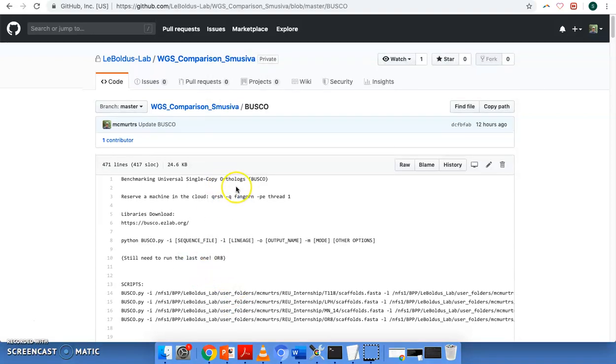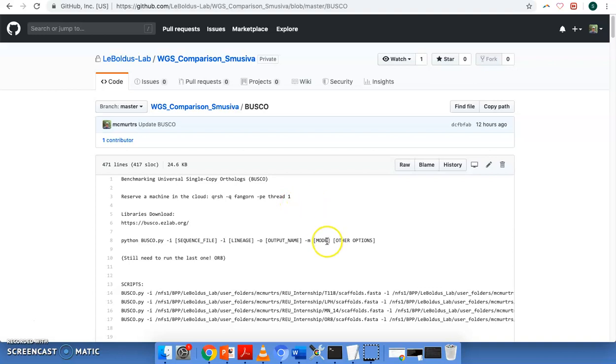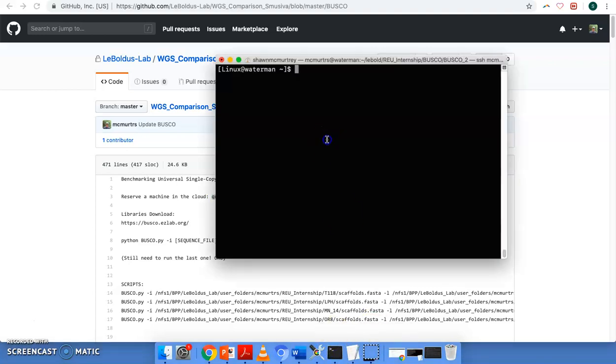I've also made another little tutorial here in our github lab. And so here's the command to reserve a machine in the cluster. I'll go ahead and do that.